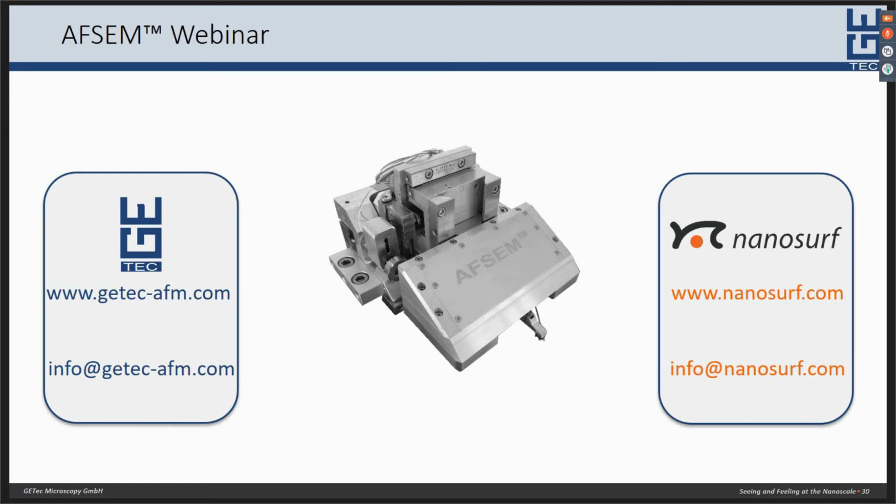And once the EBSD measurement is done, you can just go into the field of view with the AFM cantilever again and do the correlative AFM EBSD SEM analysis at the same position where you have taken the EBSD measurement.